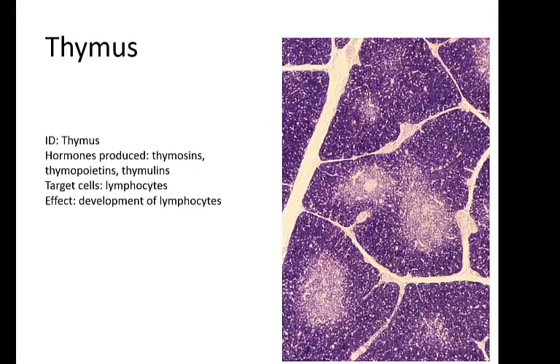Now is our thymus. This is a pretty slide. I like this slide. Okay, lots of purple. This outer region of the thymus is called the cortex, and we have the inner medulla, but they're all lymphocytes in the thymus. You can always tell your thymus because to me it looks like a bad dye job, like somebody spilled some bleach in here. It's just the inner medulla, with fewer lymphocytes compared to the more lymphocytes on the outside.